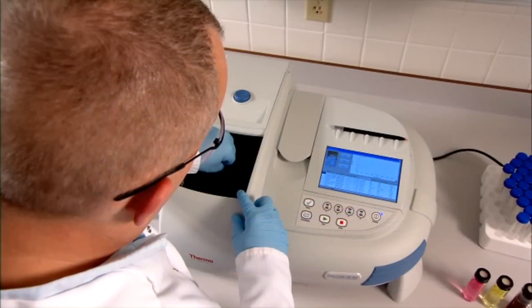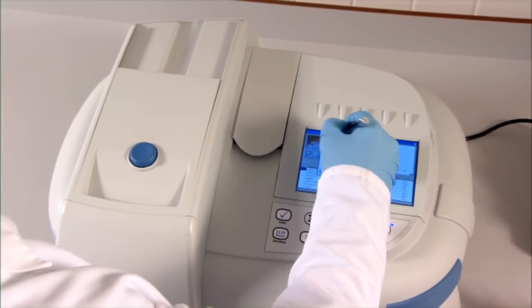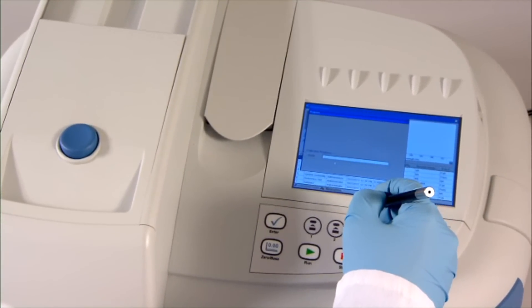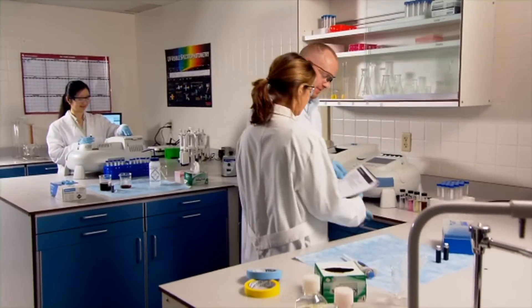Its modern design, unparalleled technology, and Evolutionary Q software offers the performance, versatility, and usability to assure high quality results analysis after analysis and user after user.